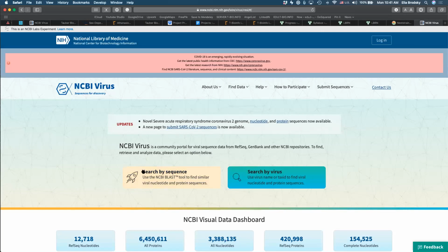So how can we find a number of different genomes? Again, these are going to be genomes typically in FASTA format, fully assembled genomes, and compare them between the different locations.